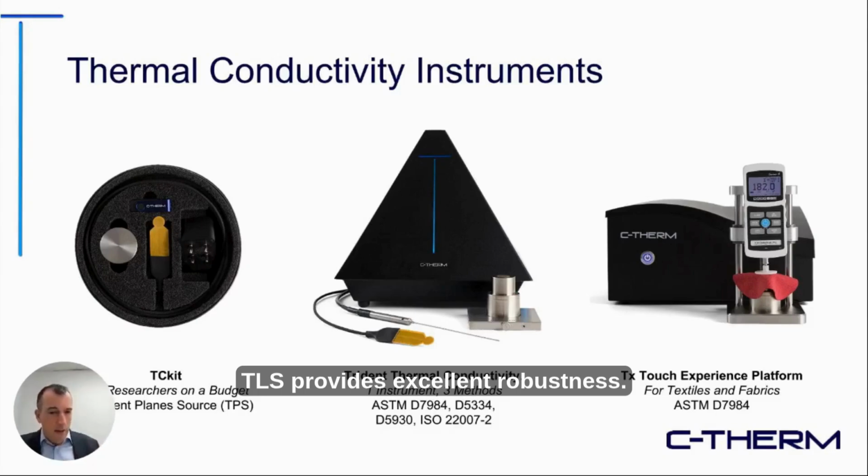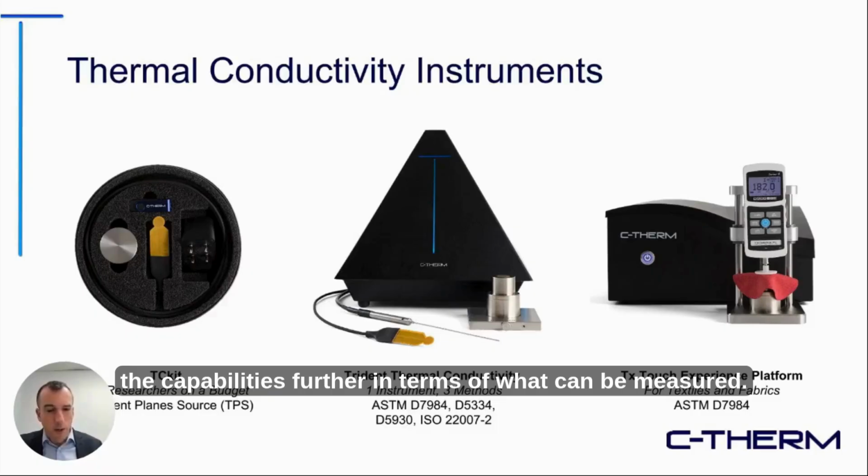And then you have the yellow sensor, which is a transient plane source sensor, sometimes called a hot disk style sensor. This sandwiches in between two samples, no need for a contact agent, and really the powerful capability that this brings is oriented towards a more experienced user that can push out the capabilities further in terms of what can be measured.